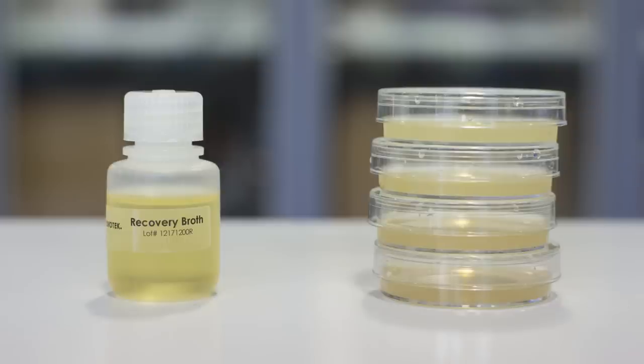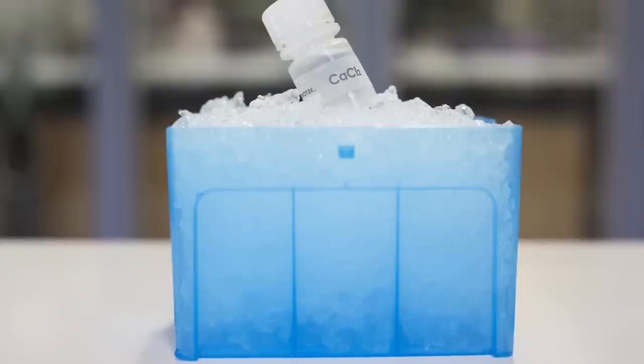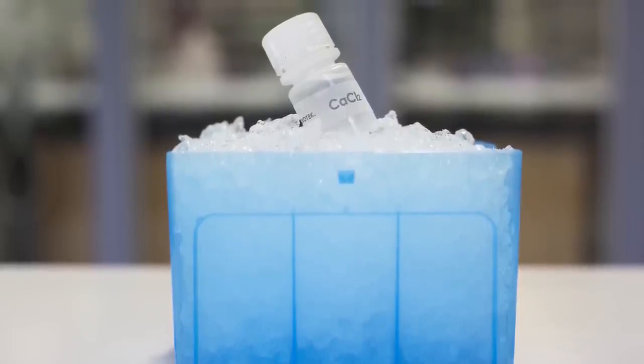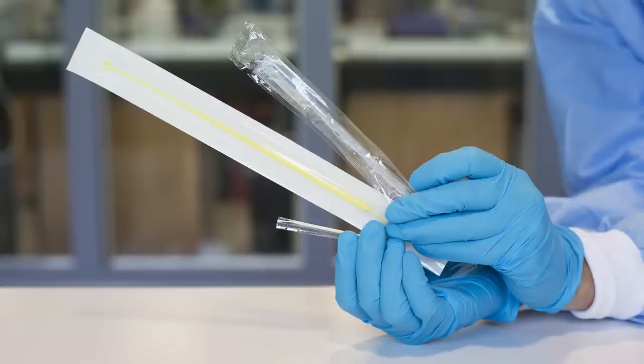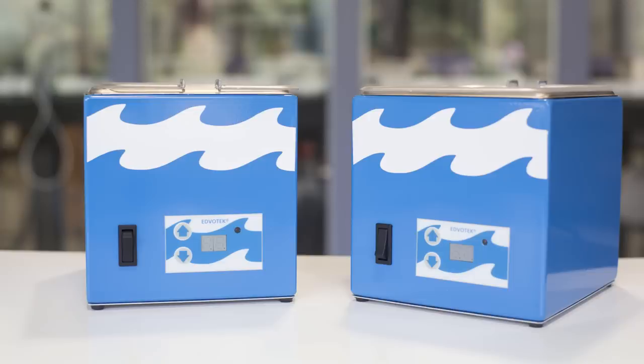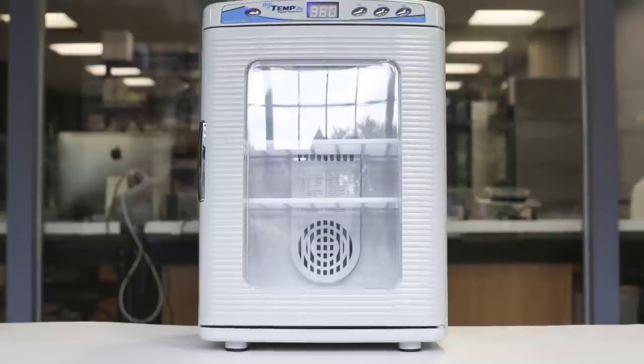You'll also need ice-cold calcium chloride solution and an ice bucket, a micropipette, toothpicks, transfer pipettes and sterile loops, microcentrifuge tubes, two water baths set to 37 degrees Celsius and 42 degrees Celsius, and finally an incubator set to 37 degrees Celsius.